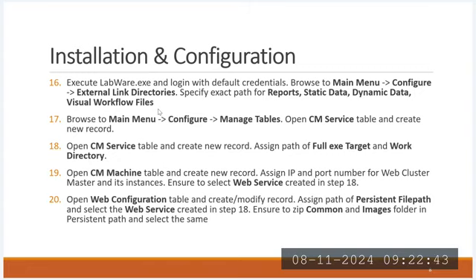Coming to visual workflows, the way the Labware LIMS application is presented will be part of the visual workflows technique. How dashboards look will all be controlled through visual workflows only. Apart from this, if you want to manage tables and CM services, meaning schedulers, this will be purely controlled through the LIMS application, and web configuration will be the same. A few customers manage both the web-based application and the desktop-based application. A few customers follow only web-based, and a few follow only desktop applications.